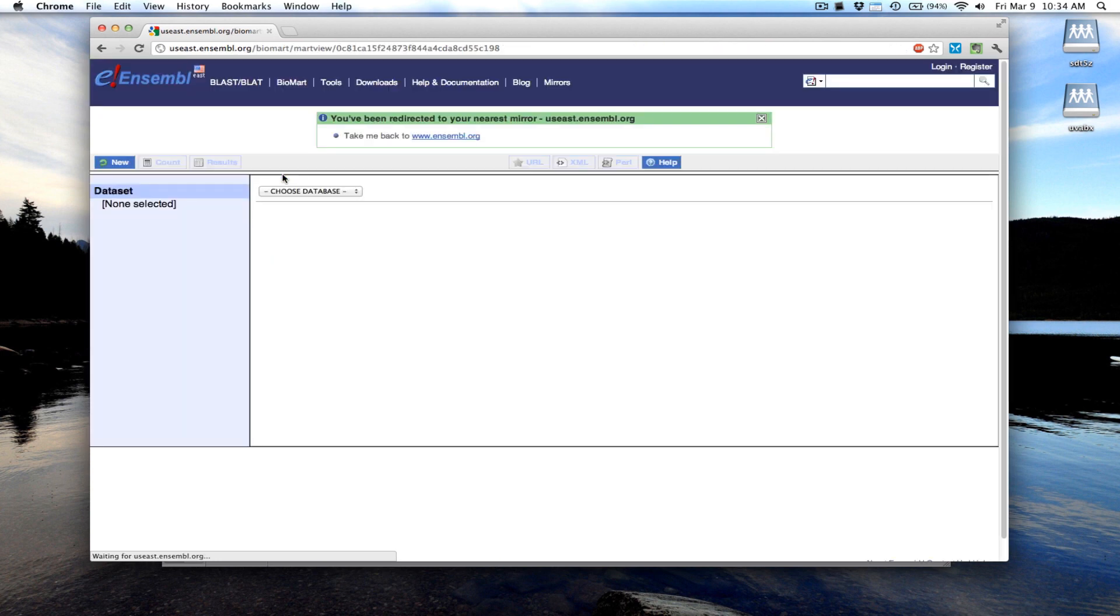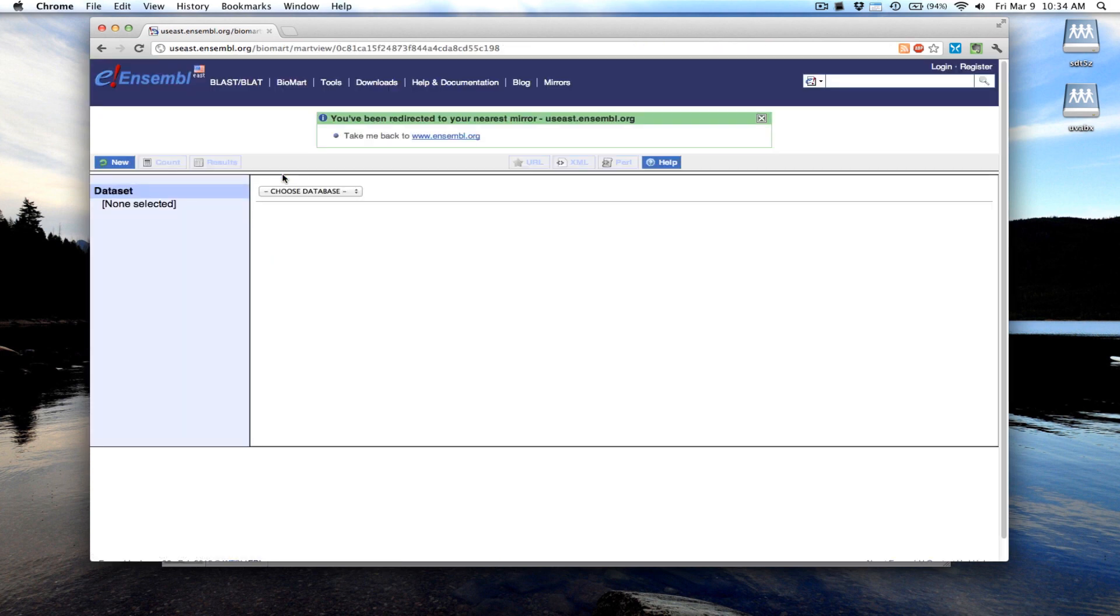With the Biomart, you essentially select the data set that you want to display, put some filters in place. In this case we'll filter that data set by the gene IDs that we have.